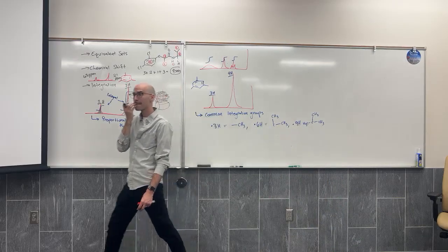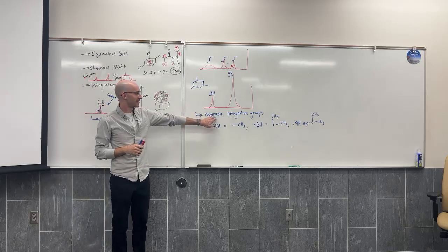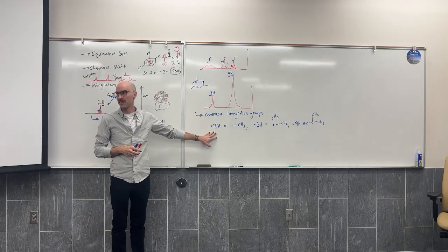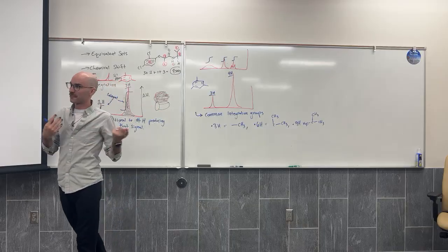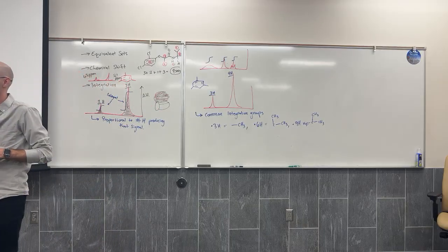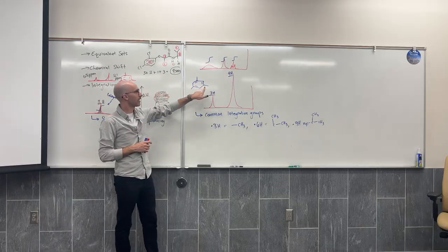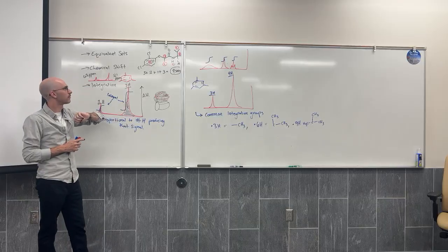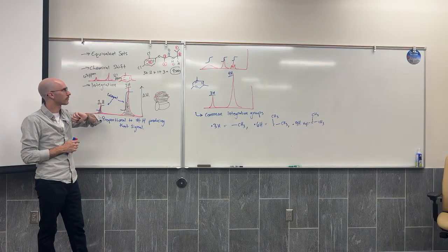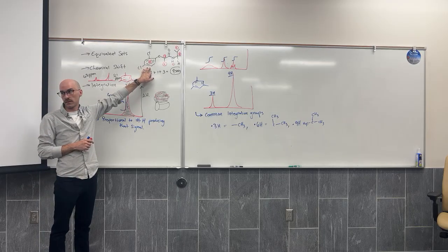Right? Yes, but in the ring, it's different. Well, yeah, not always will 3H be CH3. But a lot of times, it's not always, as we just proved. Is your 9 sets for just the ring? The 9H, yeah. 3H, 6H, 9H. No, on the phenoxyethyl. So we could have put the phenoxyethyl, those 3 lines at 7, together. Oh, yeah, okay, that's a good point.